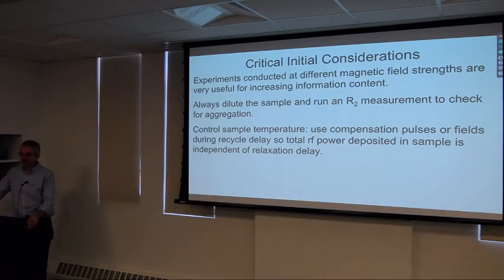But then you have to make sure, of course, that the dummy pulses aren't doing anything that affects the recovery of the density operator back to Boltzmann equilibrium. These compensation pulses frequently aren't shown in papers, so if you're implementing a pulse sequence from a paper, you probably are going to have to figure out on your own where the compensation pulses are going to go. Or if you're sent a pulse sequence by somebody, you're going to have to look in the pulse sequence and make sure that there are compensation pulses.